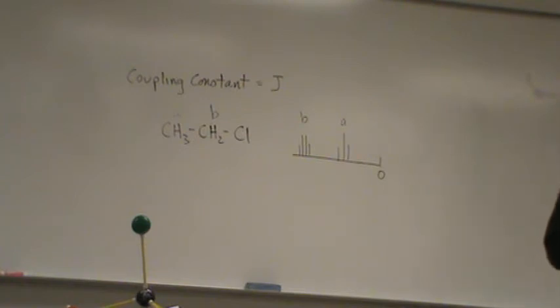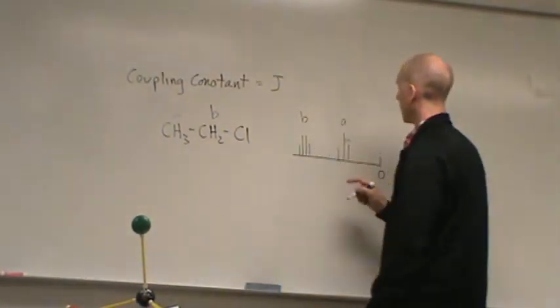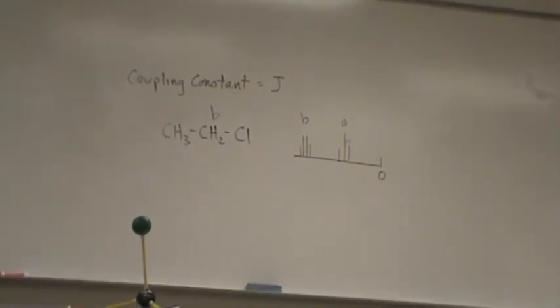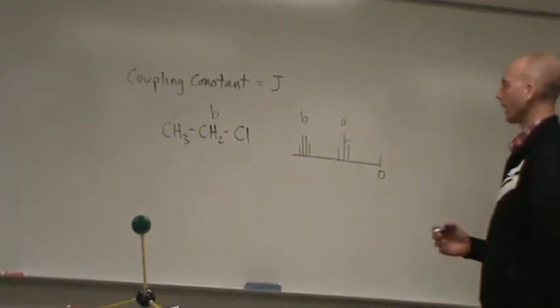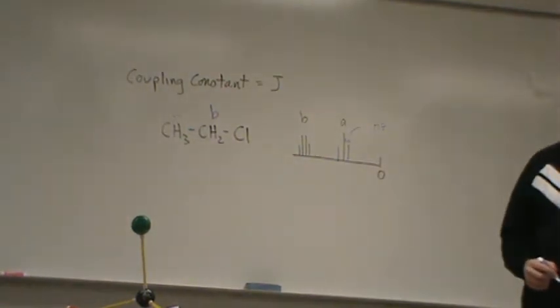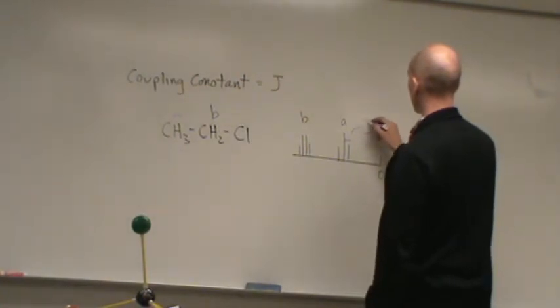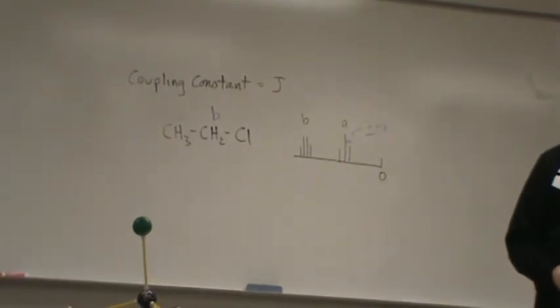Okay, we're going to look at our friend from a different angle now. What we can do is go in between the splitting here and measure the distance of those split peaks, okay? And that distance is going to be measured in hertz, okay? And let's say that distance, we'll just pick a number, turned out to be 7 hertz, okay?